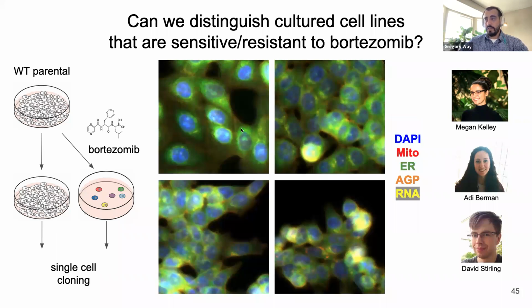In all of those clones, we applied the cell painting assay, and this is the 5-channel merge representation of the individual cells. And typically, if I'm giving this talk live, I would ask the audience if they could tell me which one of these images is resistant and which one isn't. So I don't know if anyone wants to jump out with a guess. It's kind of harder to do over Zoom.